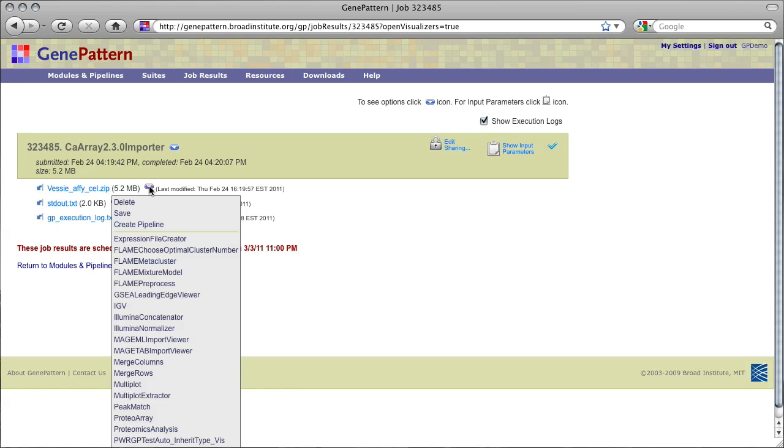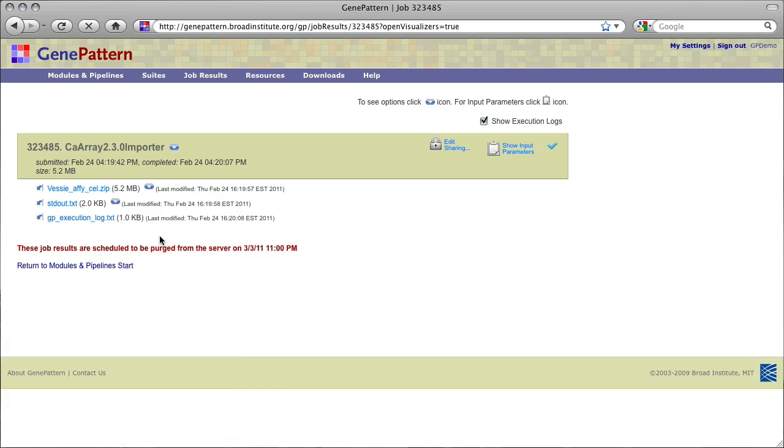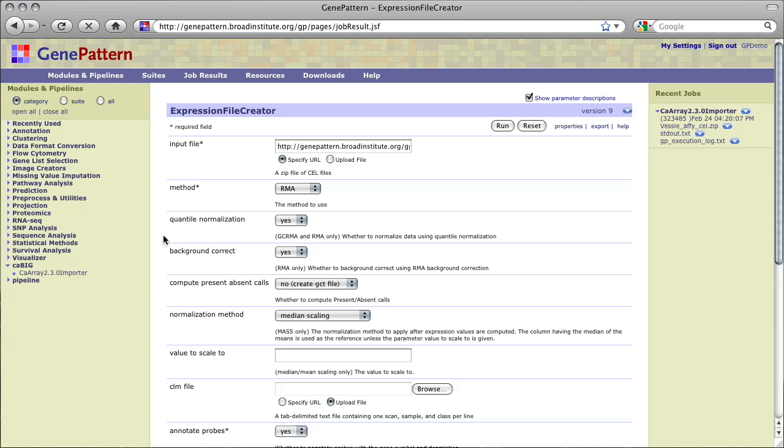Since we imported raw expression data, we could pass our resulting .zip file to ExpressionFileCreator to convert the cell files into a GenePattern .GCT file, which could be passed on to many other GenePattern modules for further analysis.